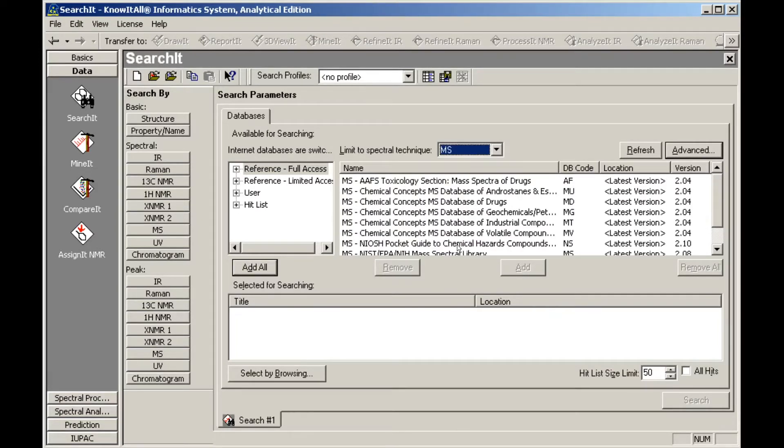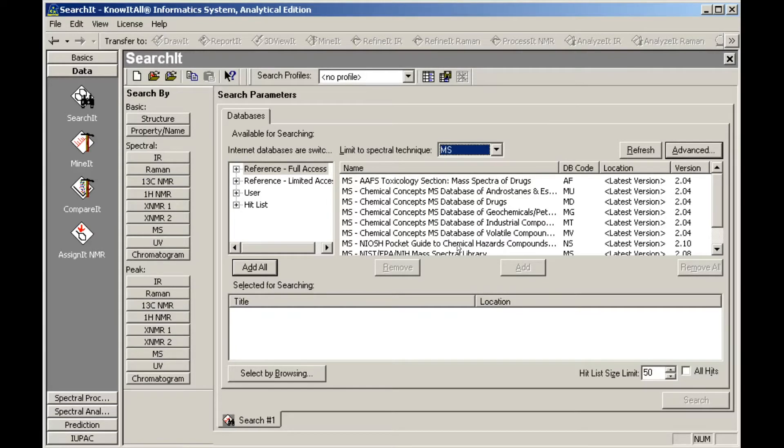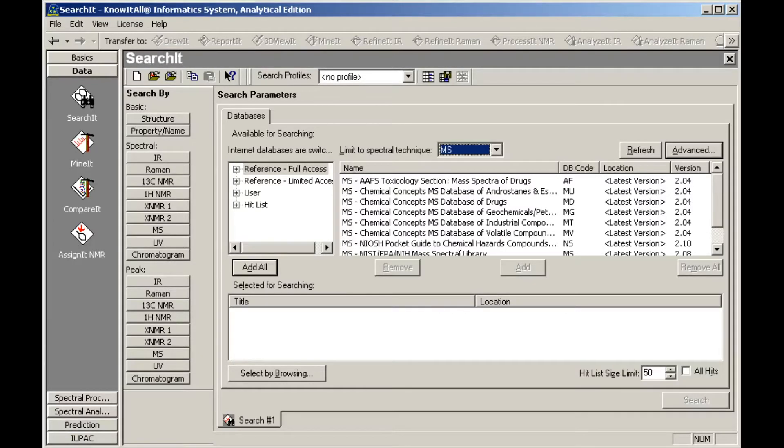The database display has been filtered to show only mass spec databases. To select a database for searching, either select it and click Add, or double-click it. You can also click Add All if you wish to search against all of the available databases.